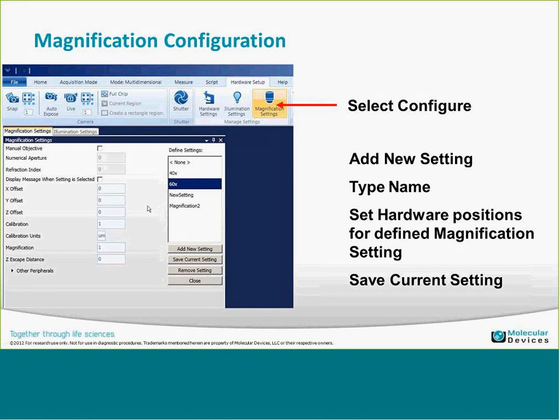Hardware settings are all the different hardware components you can control with preset values. For example, you can set an X, Y, and Z position value and call it 'Field of View 1,' then select it from a dropdown to go to that position automatically. Hardware settings are overarching above illumination and magnification — if you have the same components in both hardware settings and illumination settings, the hardware settings will override the illumination settings options.